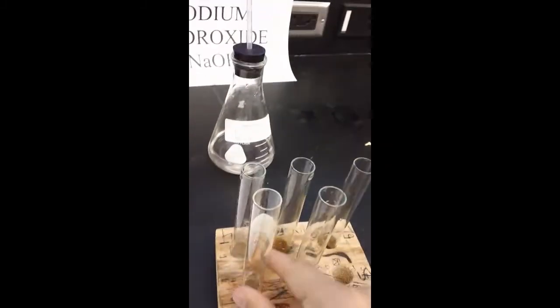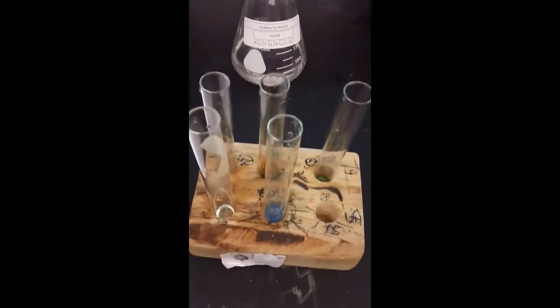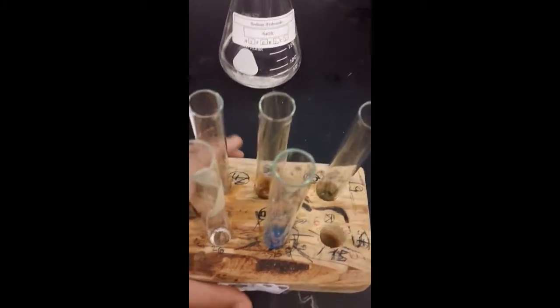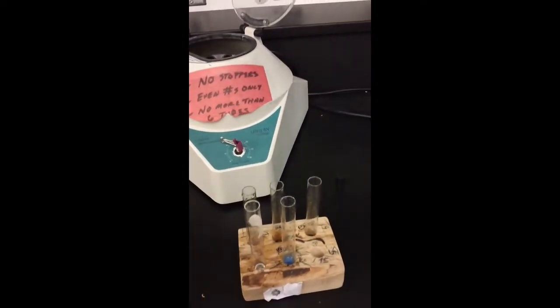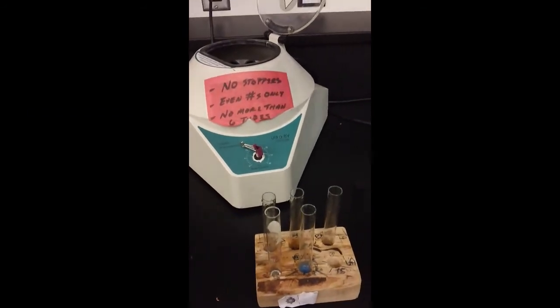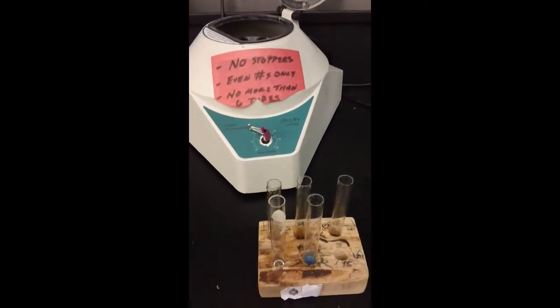So even if we don't think there's a solid in there, what we need to do now is centrifuge all of them, but at this point you should have written down if any of them did form a solid or if they did not form a solid into your chart. Okay, so I'm going to take these over to the centrifuge, and I'm going to come back with the video clip after I've centrifuged them. So again, this is test C before centrifuging, but after we have added our NaOH, which is sodium hydroxide. Make sure your data table now has if each one has formed a solid for test C before centrifuging.